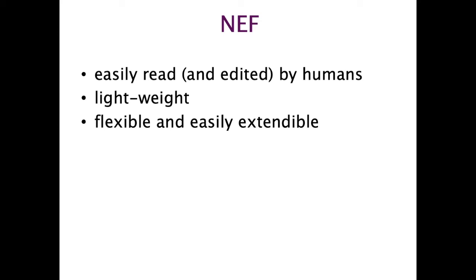And then the next two points perhaps are the most important. Traceability of data. This means, for instance, in your peak lists, each peak is given a unique ID. So peak 1327, when it leaves my program, goes into the NEF and goes into another program, remains peak 1327 when it comes out of that program again. And each time you're reading in and out, that peak will always stay peak 1327.